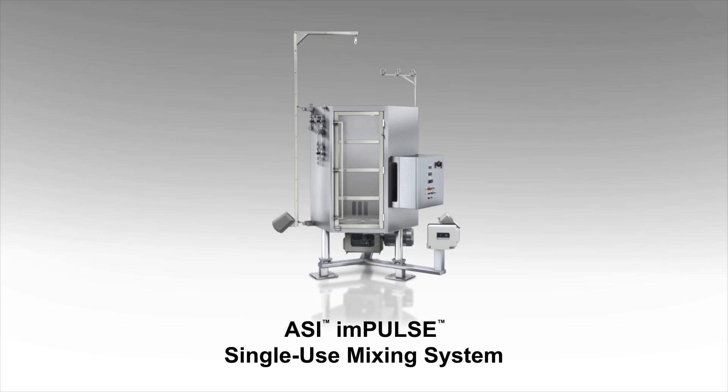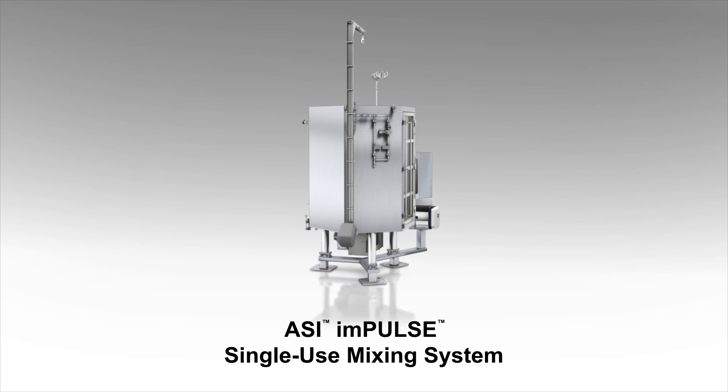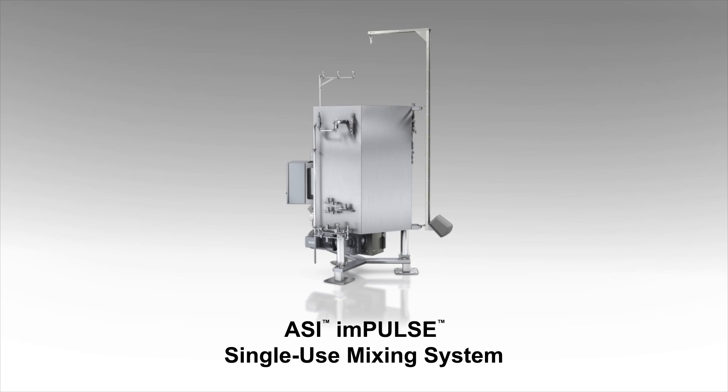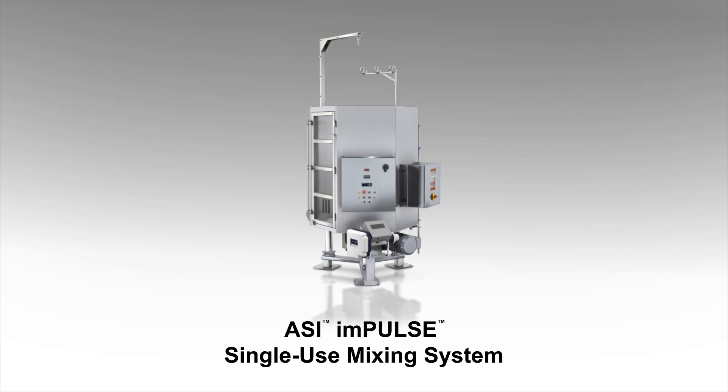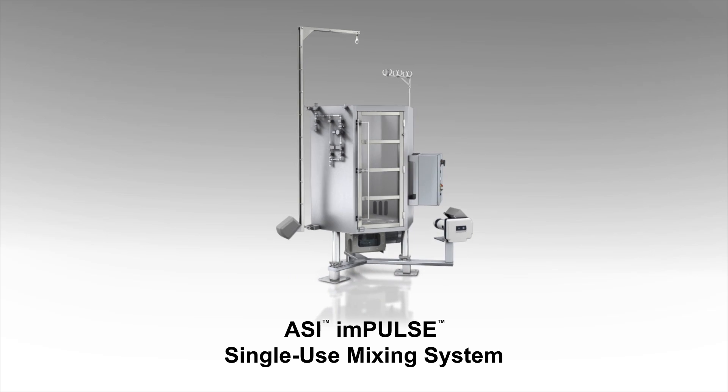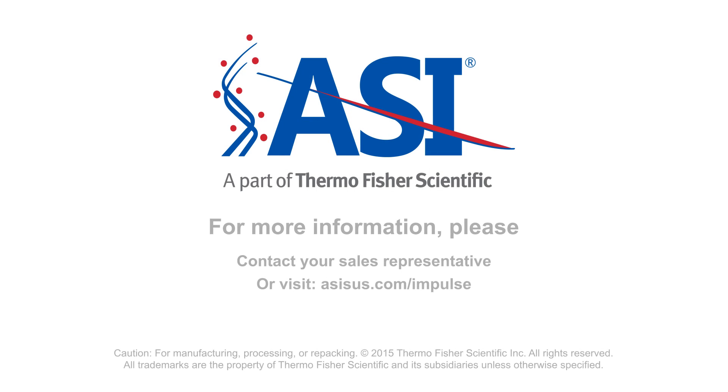The next generation ASI Impulse single-use mixing system. An innovative, flexible, customizable, and scalable mixing solution for volumes up to 5000 liters. For more information, please contact your sales representative or visit ASISUS.com/Impulse.